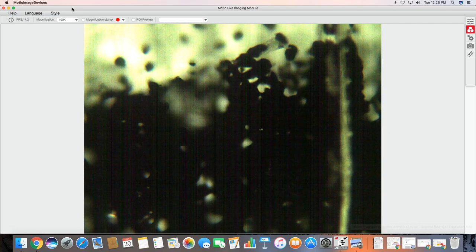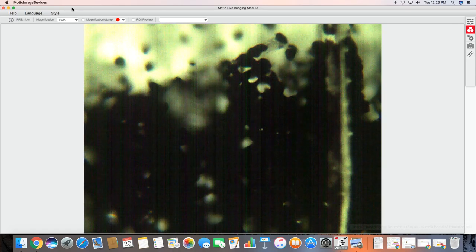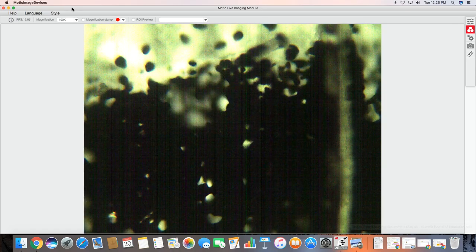Then move into the yellow. Adjust a bit so it's clear and sharp. And then if I want even more detail switch right to the blue. Use my fine knob only to make it clear.